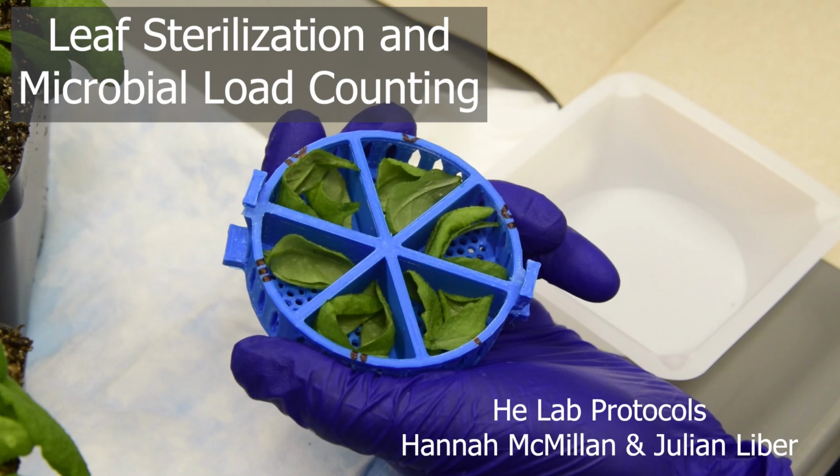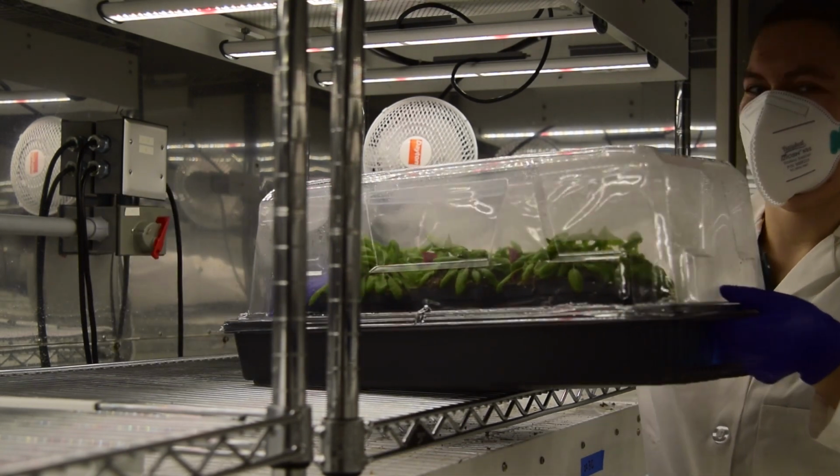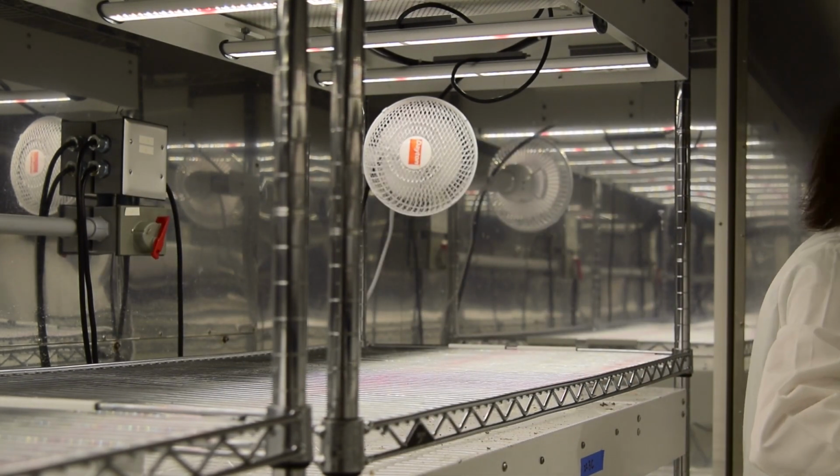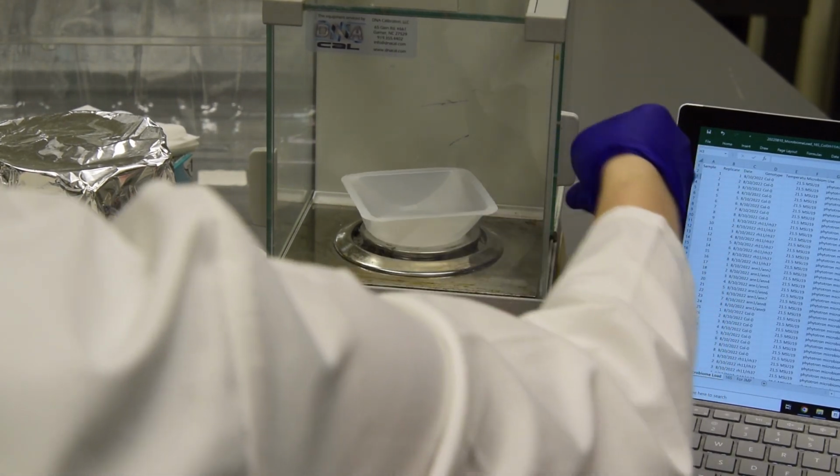Welcome to our video on Arabidopsis leaf sterilization and microbial load counting. Remove plants from their growth chamber or other growth environment. For each sample, we will measure its mass to get a count of microbes per unit fresh leaf mass.